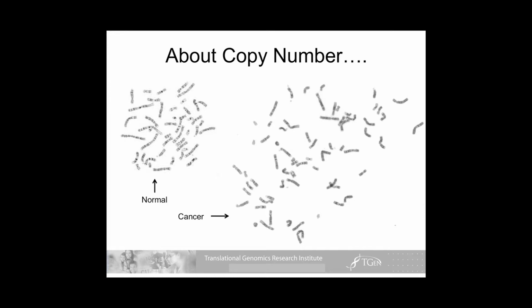One thing that should be dramatically apparent to you is that there are way more chromosomes in the cancer than in the normal cell, okay? The other thing that should be apparent, that you may not have seen if you sat here and counted, is that this is not twice this. This one was roughly, I want to say, just shy of 69, hypotriploid. Okay, and then it's not normal.